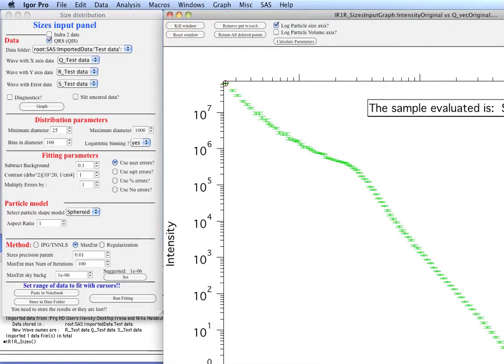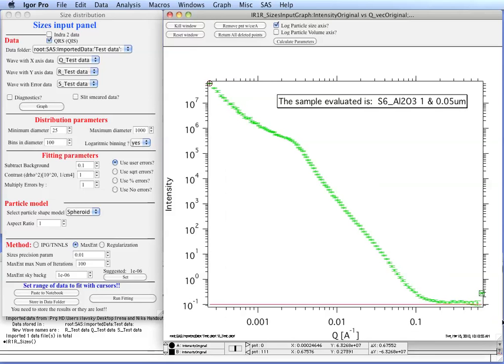Let me show it in the field of view of the movie. So now we have intensity in cm⁻¹ cm² per cm³, absolutely calibrated. And then here we have Q. You can see the scattering now. If you look at that, there is some kind of hump here which indicates smaller sizes. There is a hump here. The power law slope at low Q probably cannot be modeled properly by this tool. It actually represents the clumps, sizes of clumps of powder particles, so we will not attempt to measure that.